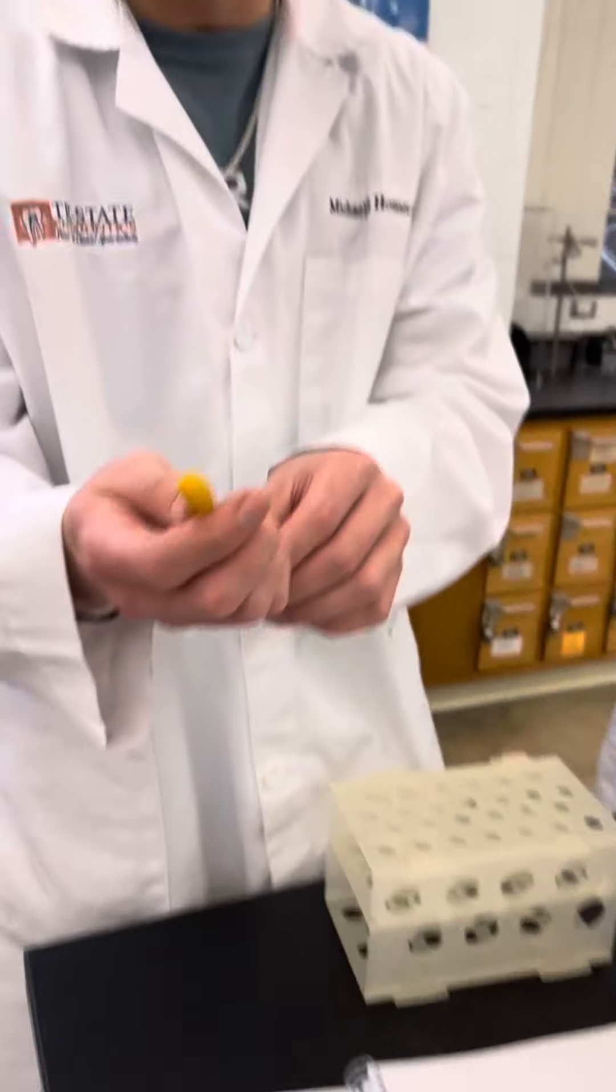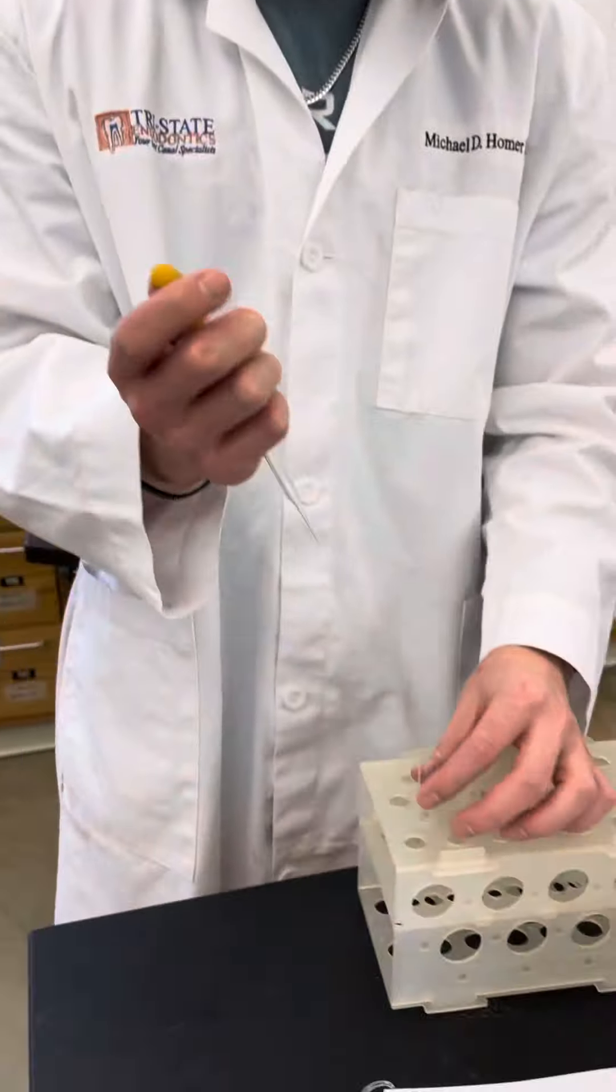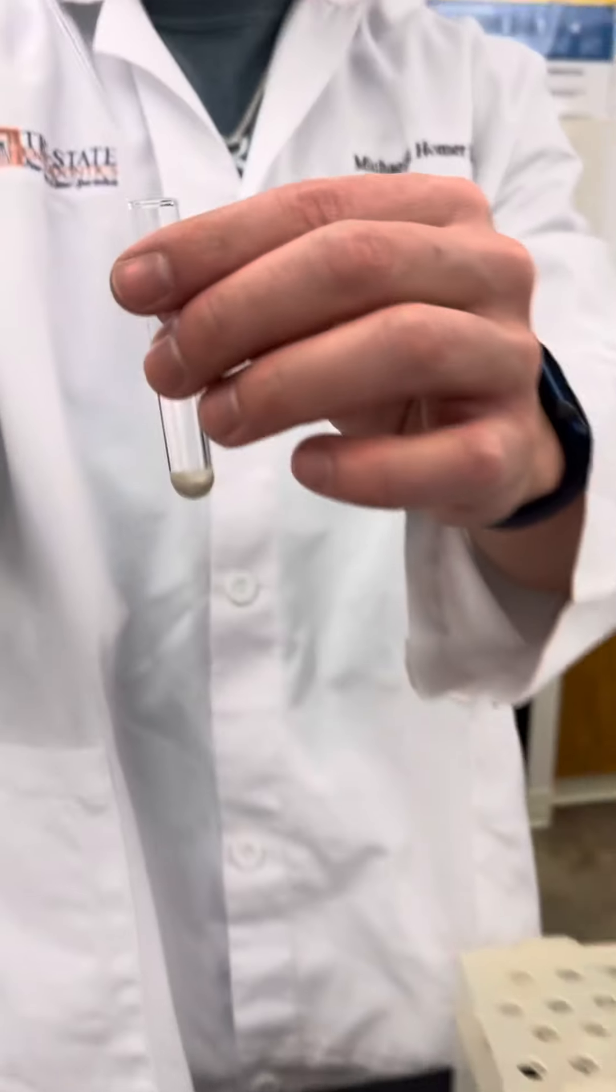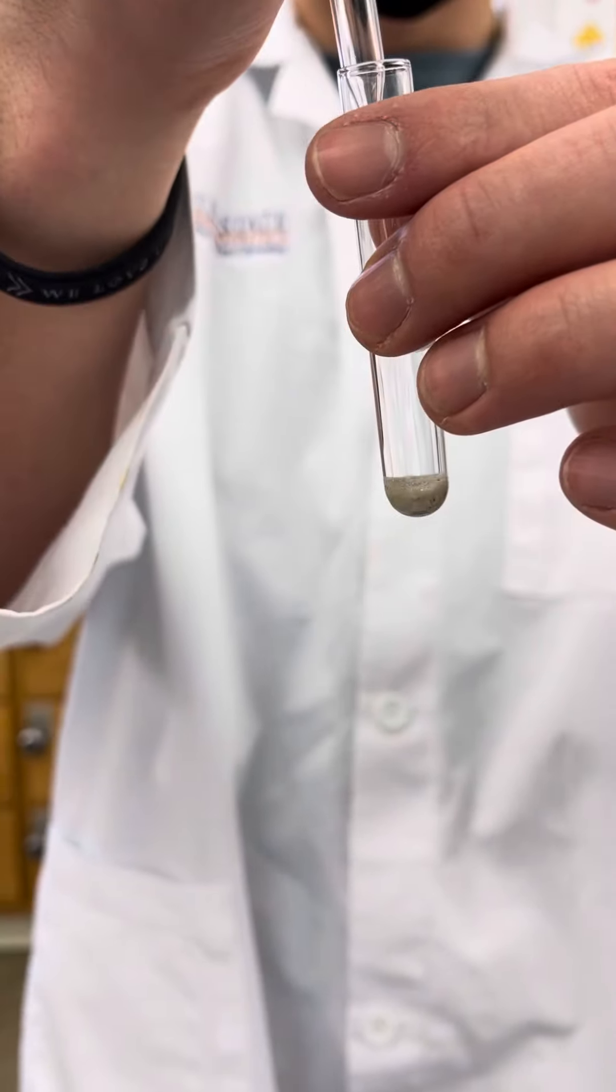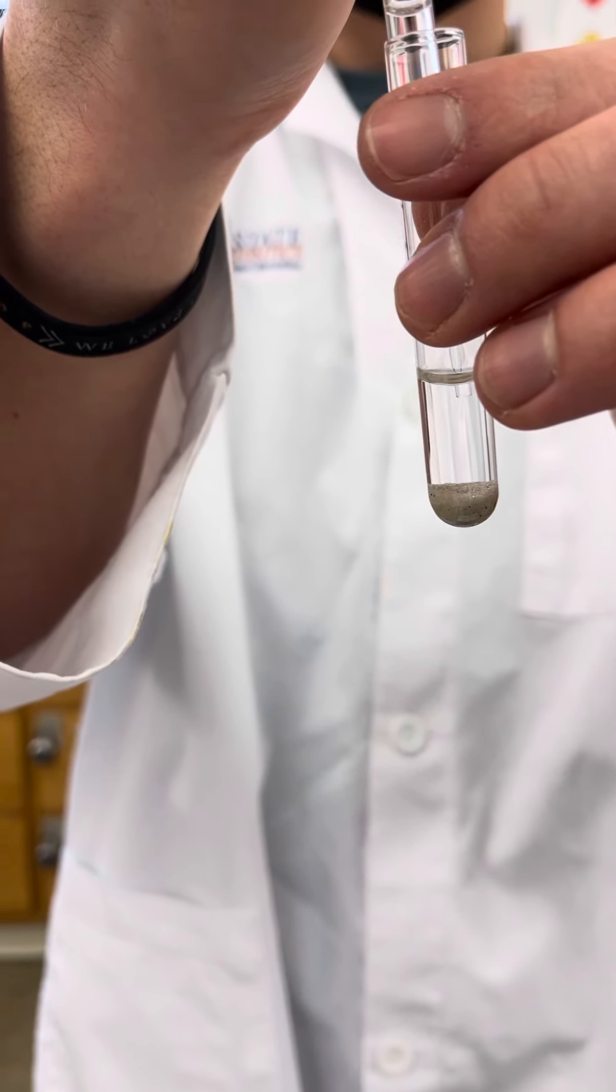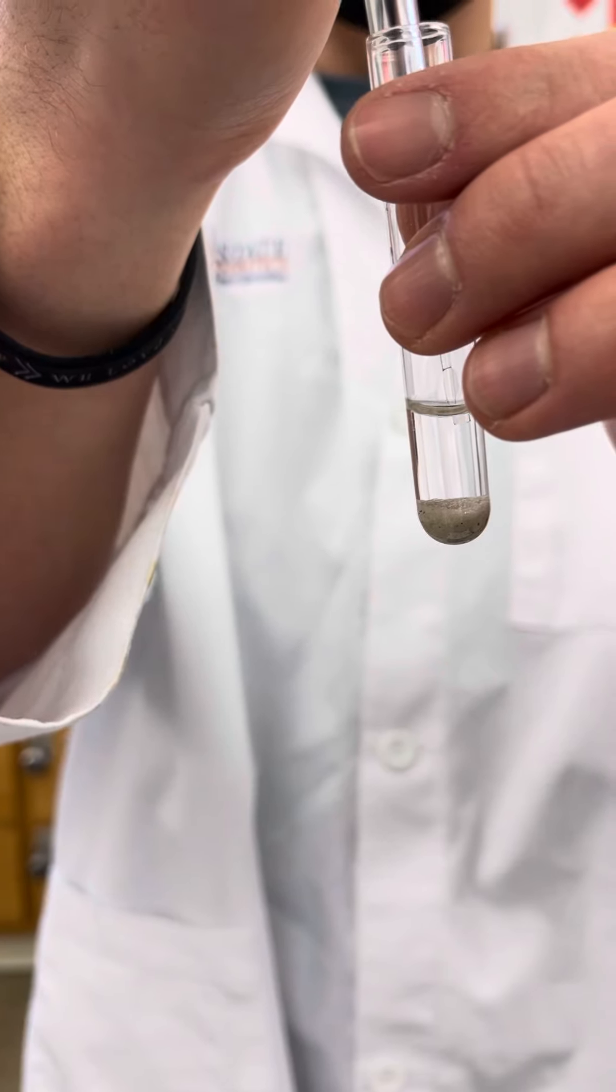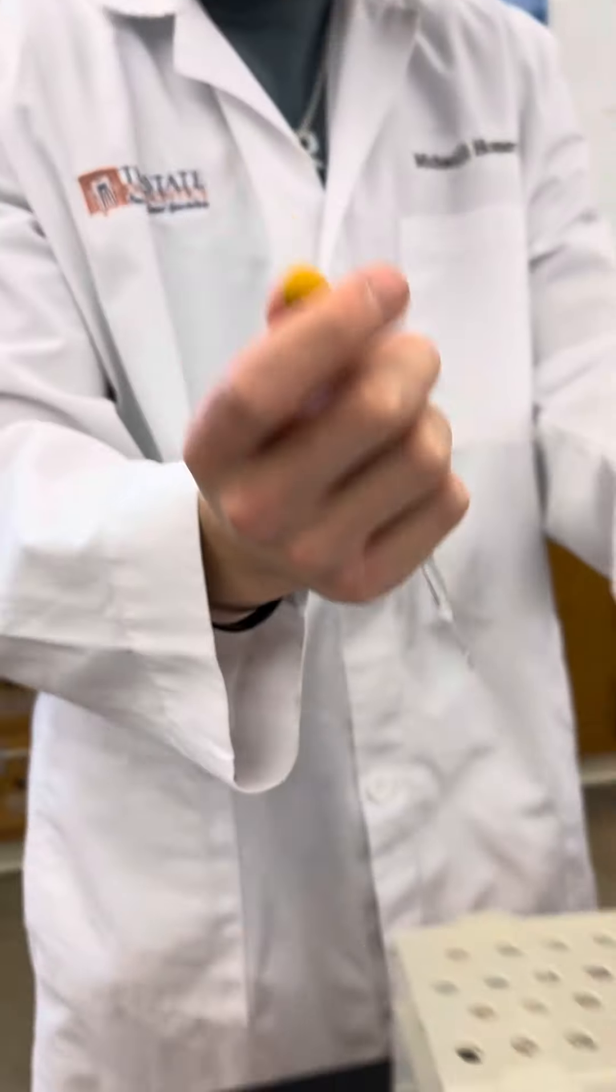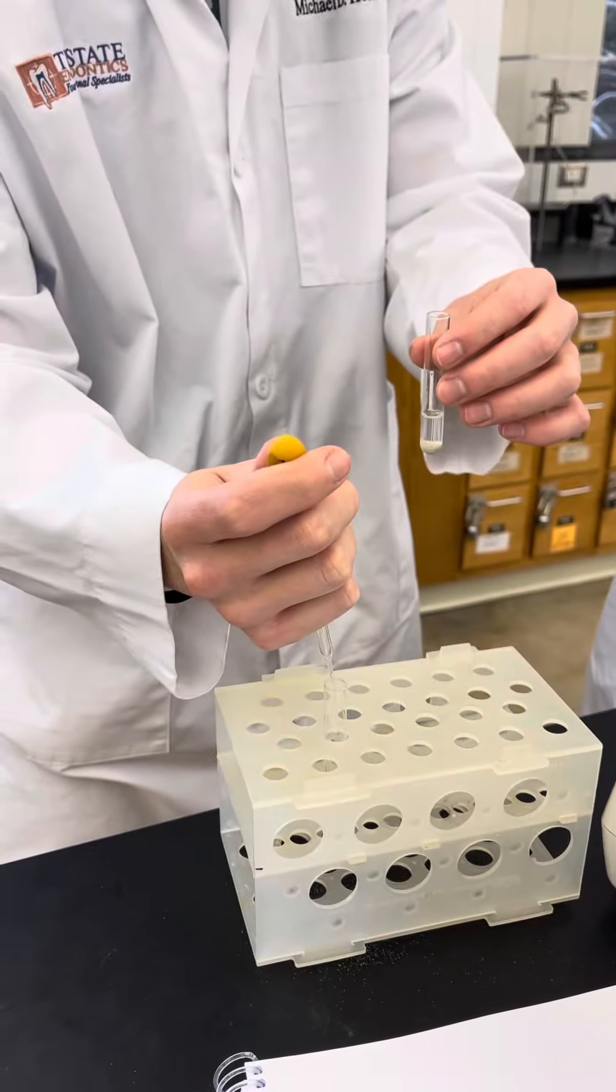And then what you're going to do to decant it, you're going to hold it properly. You're going to put it in and try to only take out the liquid above your precipitate. And you're going to put it in your waste beaker, or test tube.